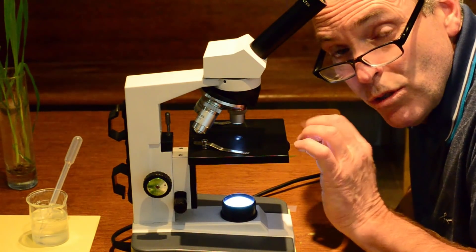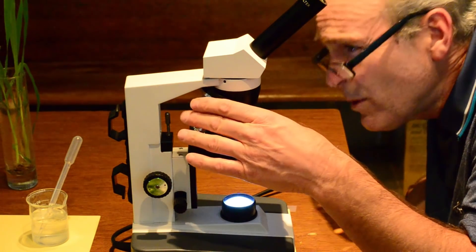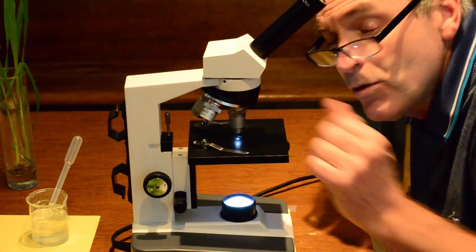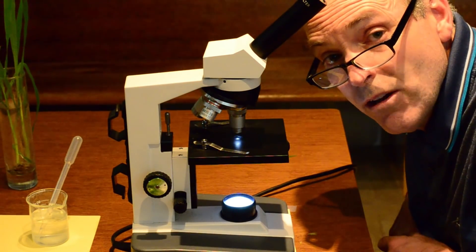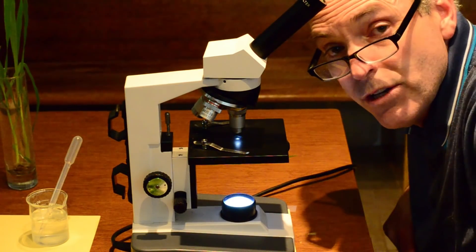We're probably only going to use the low power, the red. And we'll need to switch to the yellow, which is the medium power. Those are the two powers that we're going to use today. We start off with your coarse adjustment knob. And then you can go to your fine adjustment knob.